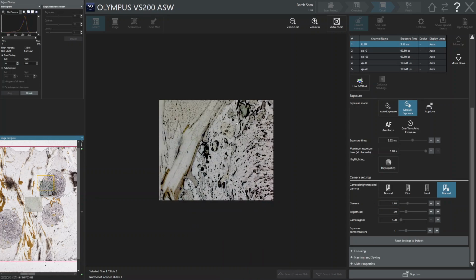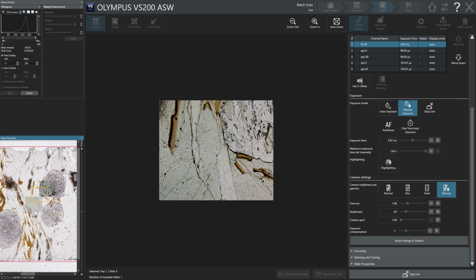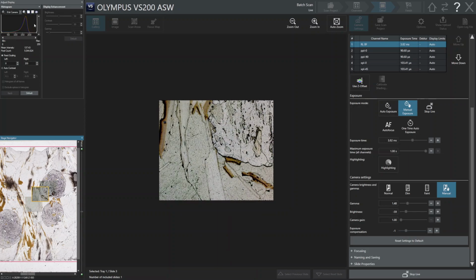instead of 1, you use 1.48, the contrast within the silica matrix of this sample will be much better, but you will risk, for example, overexposing. If you see at the top left of the histogram, the pixels in the very reflective phases. Therefore, there is a compromise and you have to check for the best settings possible.